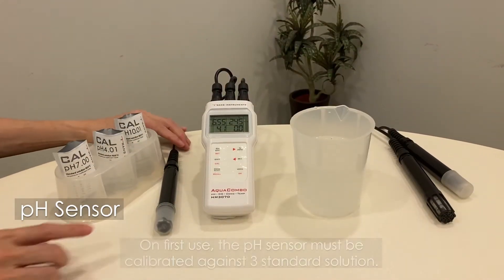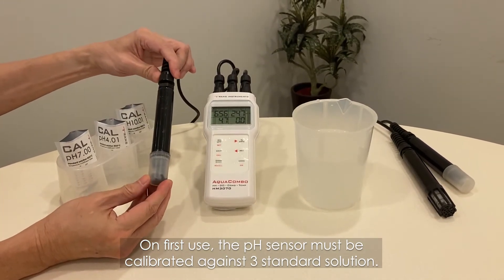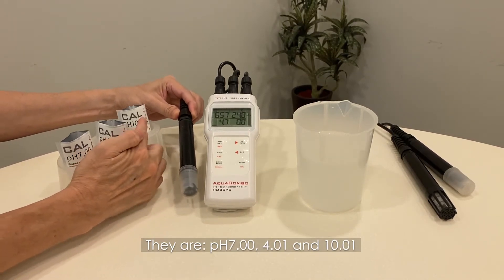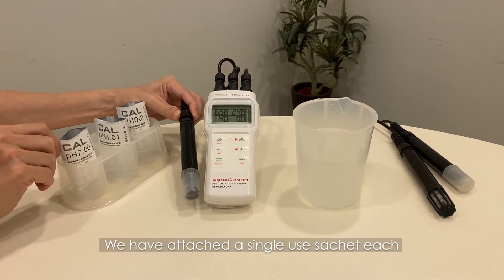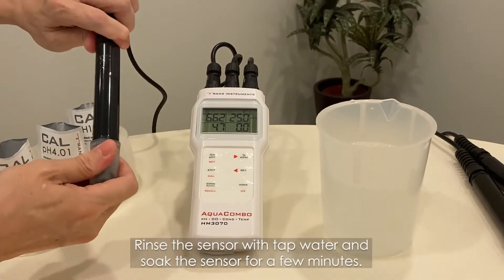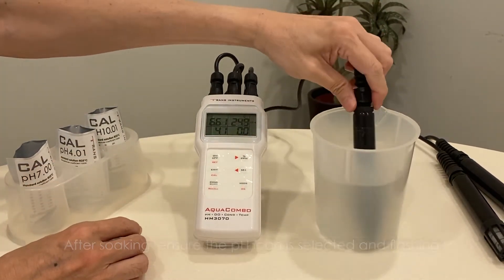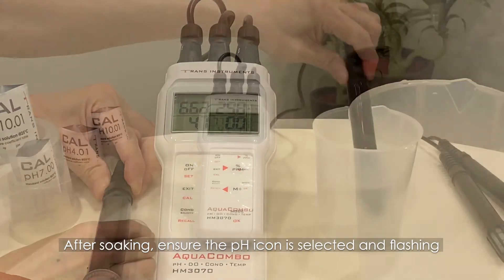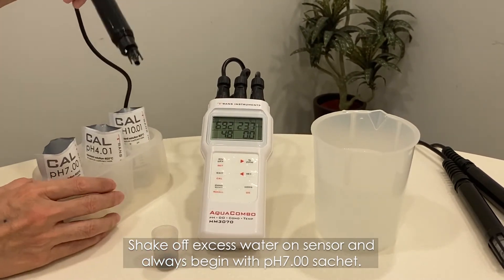On first use, the pH sensor must be calibrated against three standard solutions: pH 7, 4.01, and 10.01. We have attached single-use sachets; you can purchase more solution from your dealer. Rinse the sensor with tap water and soak the sensor for a few minutes. After soaking, ensure the pH icon is selected and flashing. Shake off excess water from the sensor and always begin with the pH 7 sachet.